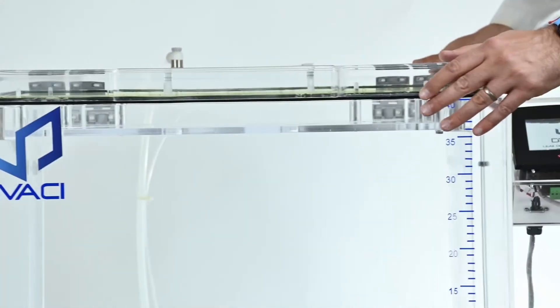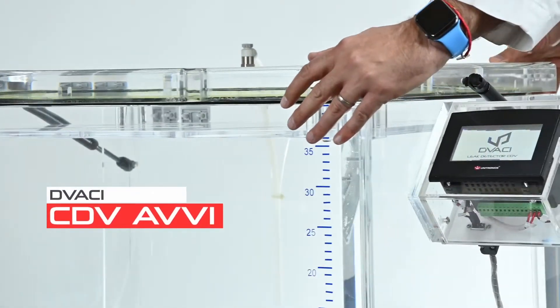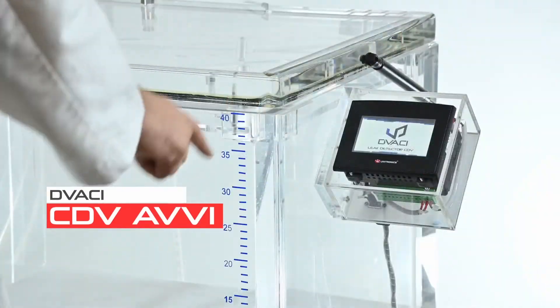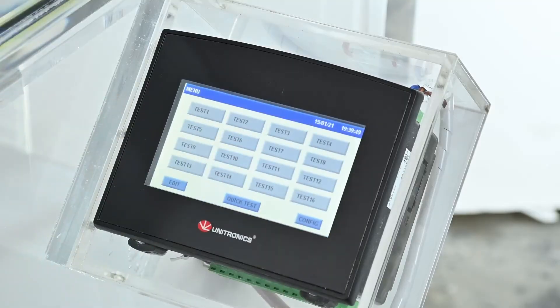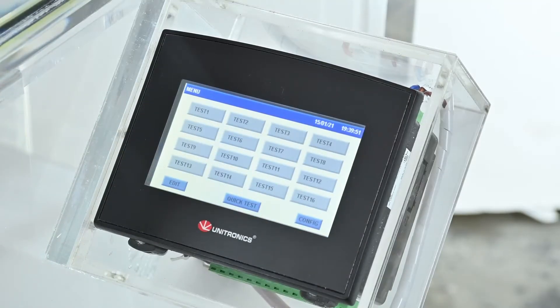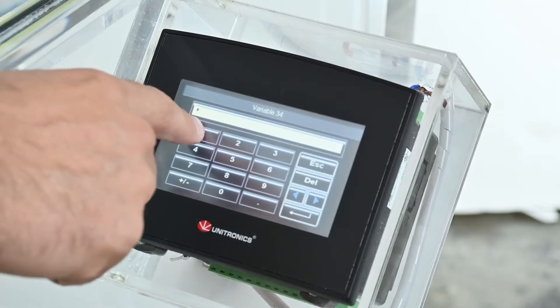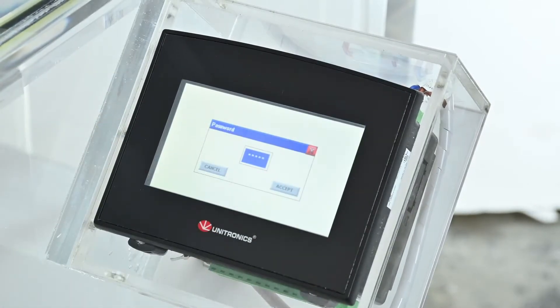The AVVI version of our CDV leak detectors is equipped with a 5-inch color touchscreen that makes the user's experience easy and intuitive. Access to the device system is password protected.